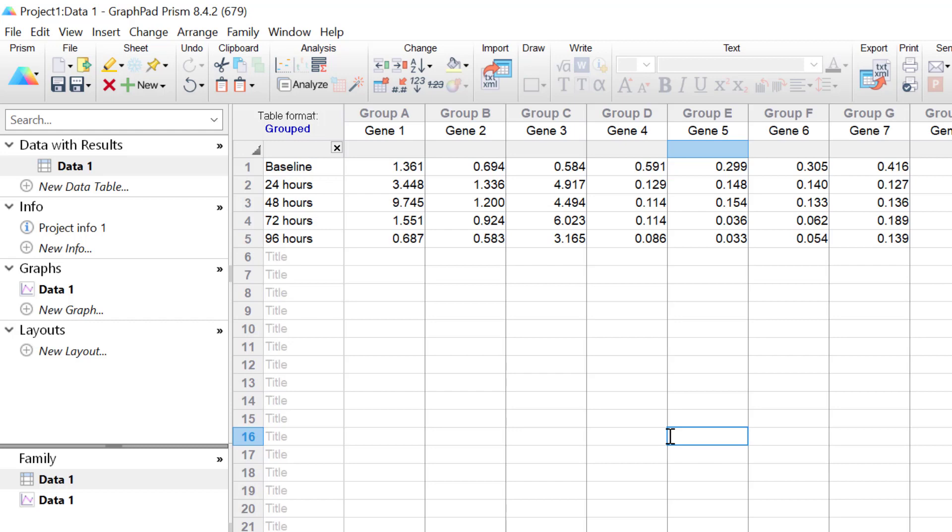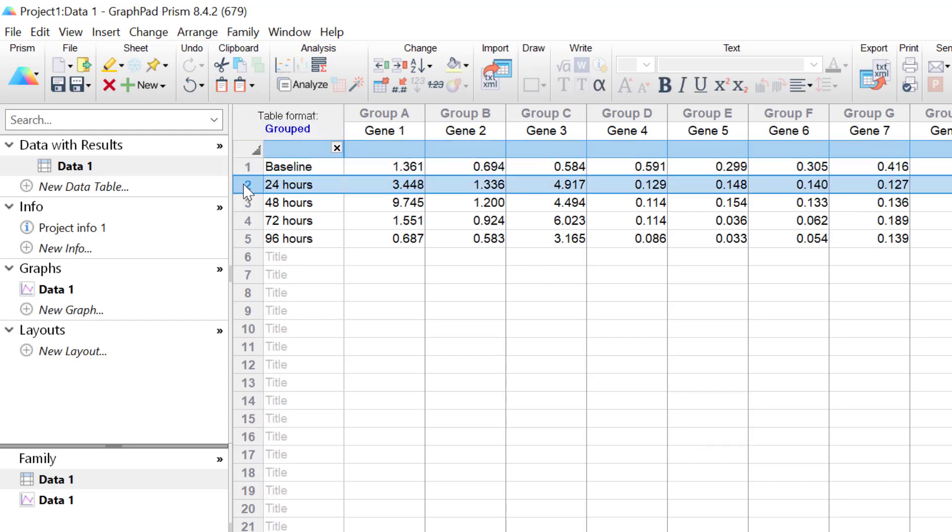Each row represents a different treatment time point after the addition of a certain drug to my cells. So the first row contains the baseline data. The second row indicates the data following 24 hours of initial treatment. And then there are 48 hours, 72 hours, and 96 hours post-treatment.